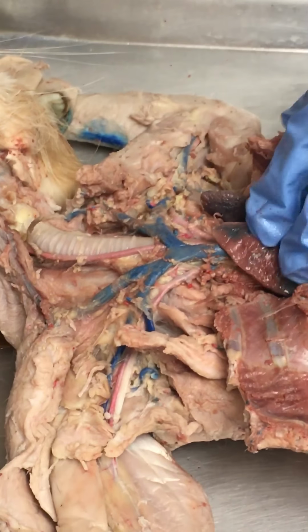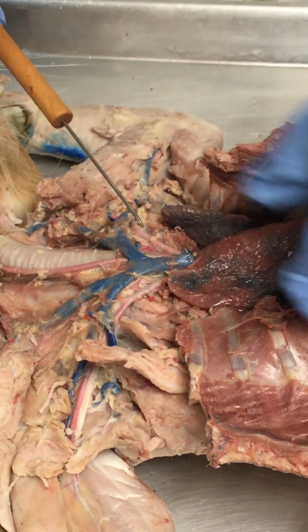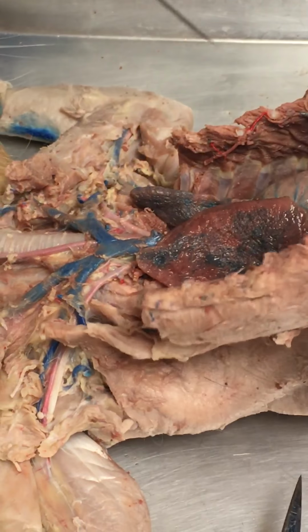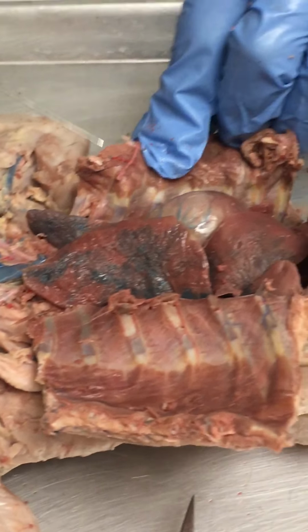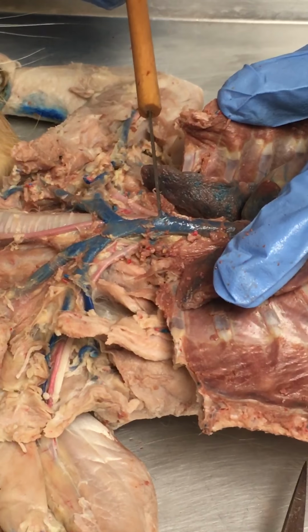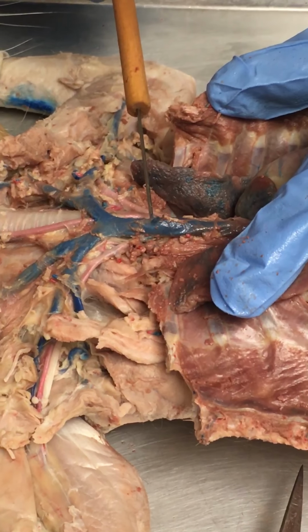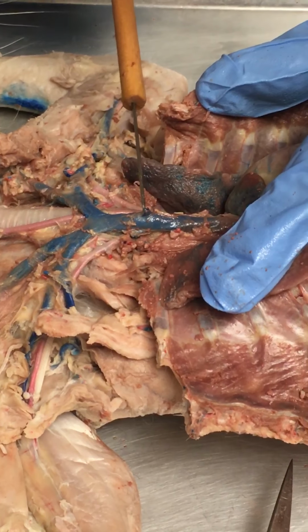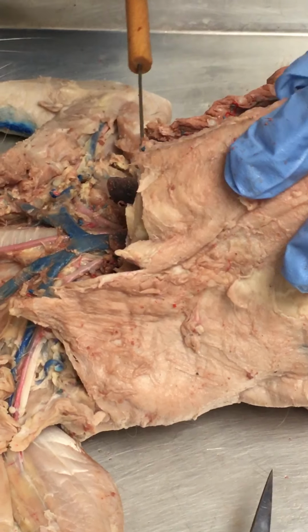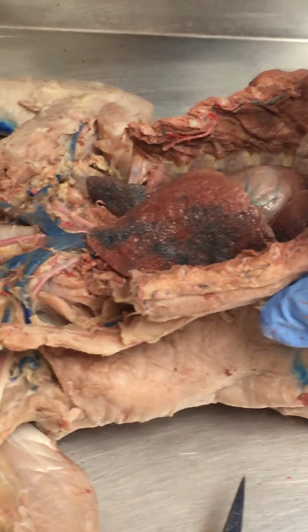The sternal, this cat has largely had its sternal vein removed, and this happens just in the cutting process. Occasionally we'll have some residual sternal vein kind of running along the sternum here, and I suspect somebody's cat out there will have it. We do have the point at which it begins. So that would be the beginning of the sternal vein, and in the cat it would have run up to the sternum, and then it would have run down the length of the sternum. So that's the sternal vein.